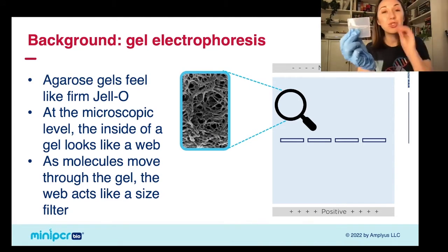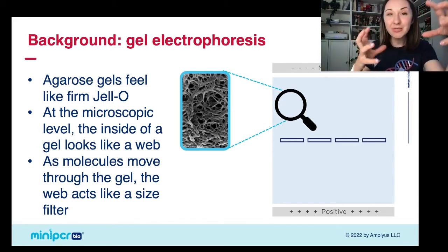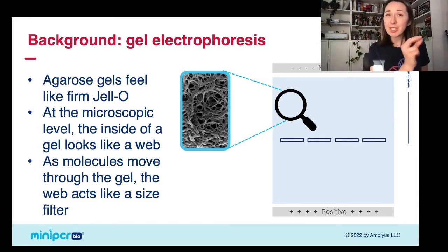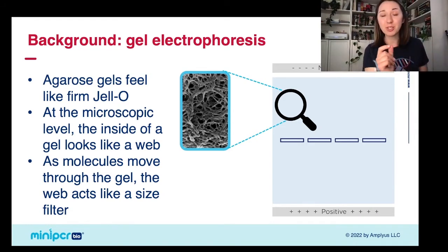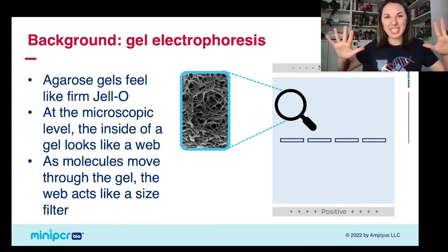And the idea is that if you zoomed way in on this, what you would see is that those pieces of agarose, which are a polysaccharide that comes from a type of seaweed, create a web full of all these different holes and pores in that gel. So as an electric field moves molecules through that gel, they're going to get hung up in these pores in this webby nature. So the electric field is going to try and pull those molecules through the gel, and that actual gel structure is going to try and resist that. And small molecules are going to be able to move really quickly through those holes and pores, but big molecules are going to get stuck. We're going to walk through this piece by piece.